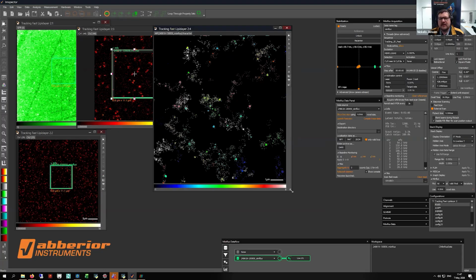What you can see here, and what you also saw, is that you do not necessarily need, especially for tracking, switching dyes or dyes that go into an on and off state. It's maybe even better to have constitutively active dyes in a low concentration. So you can always have only one dye in your donut and can track this dye.